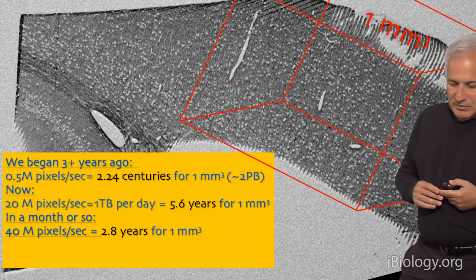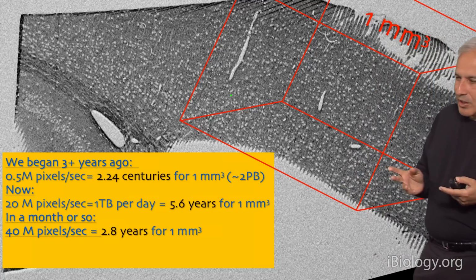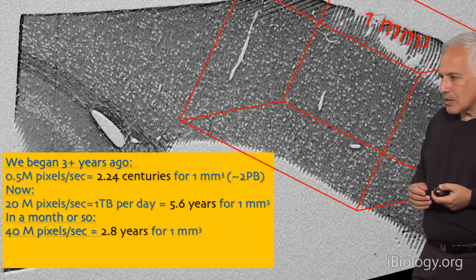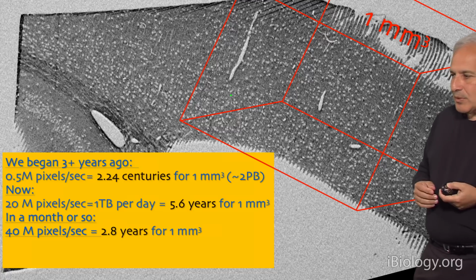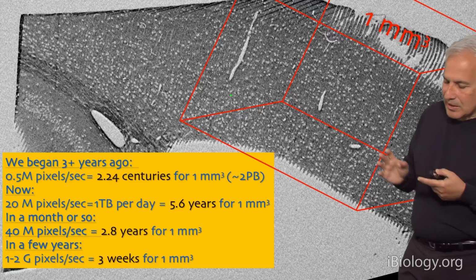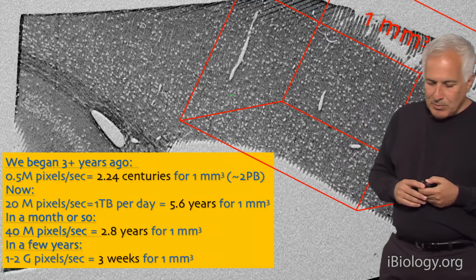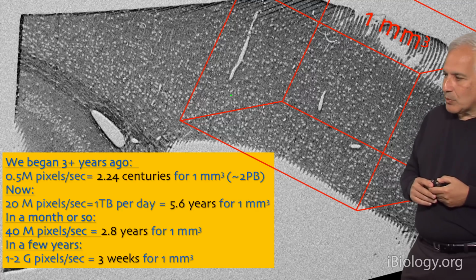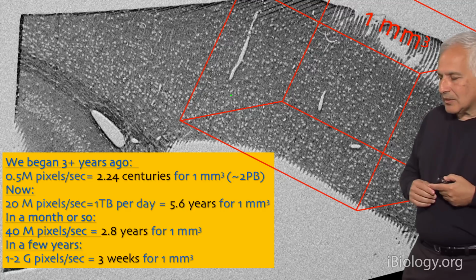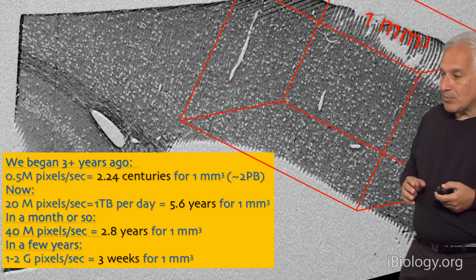That's still too long to do, I think, useful comparative biology of different brains that maybe have different experiences or different diseases. But soon we hope to be going much faster, another 60-fold faster or so, going over 1 billion pixels per second, and thinking about doing cubic millimeters in less than a month, maybe even a few weeks. And the way we're going to go that fast is by, instead of using scanning electron microscopes that have a single beam, using scanning electron microscopes that each have many beams in them.